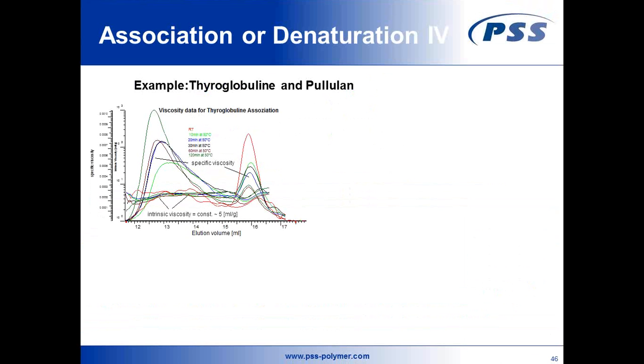So we took our thyroglobulin and did the same type of experiment by heating and stressing our protein, and we measured the density, or the intrinsic viscosity, of our protein as 1 over density. And besides the fact that we again saw this high molar mass sample, we did not see any change of the intrinsic viscosity.